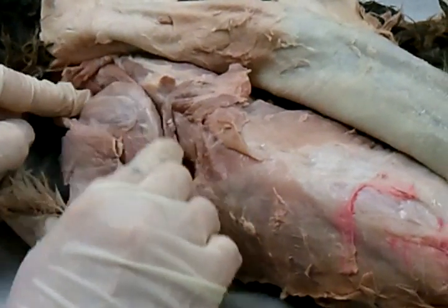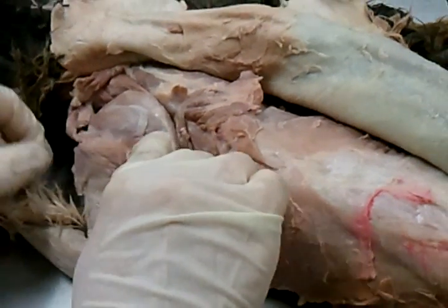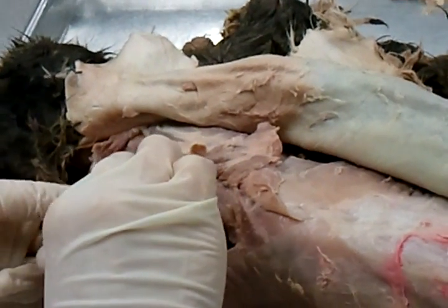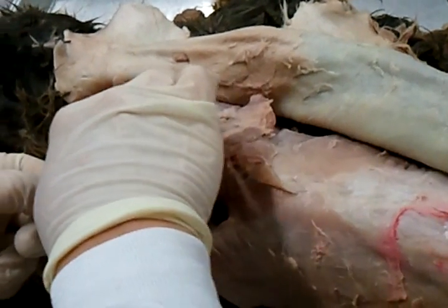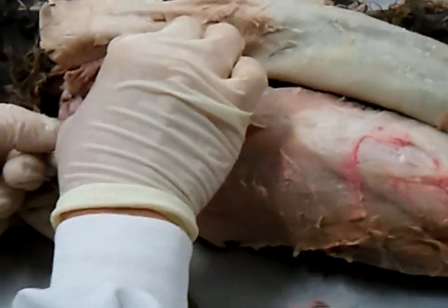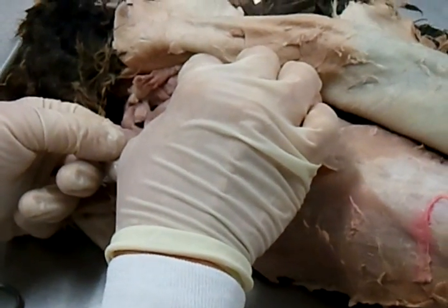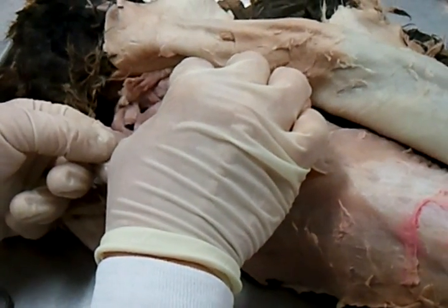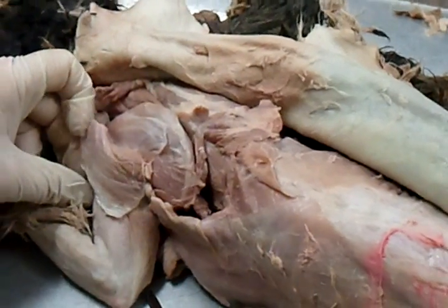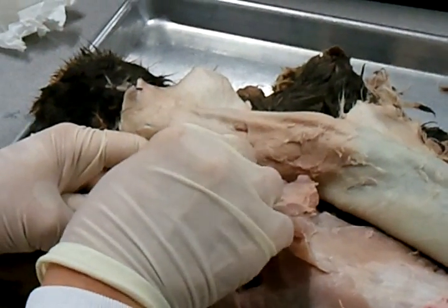Do you see the scapula? The scapula actually — if you feel it, you can feel it now, not on the exam — has a spine that runs like this that this acromeo trapezius is on. That's the spine of the scapula you learned about. There's a muscle above the spine. What do you think it's called? Superior to the spine — supraspinatus. There you go. So the one that's above the spine is called the supraspinatus. This whole muscle right here.